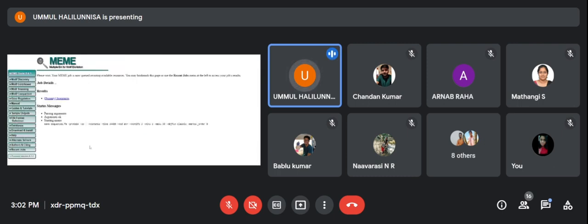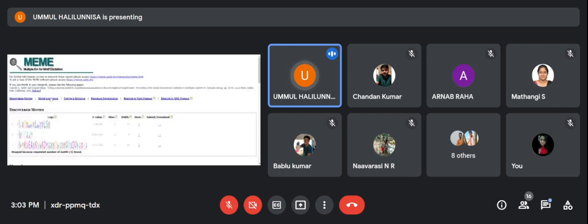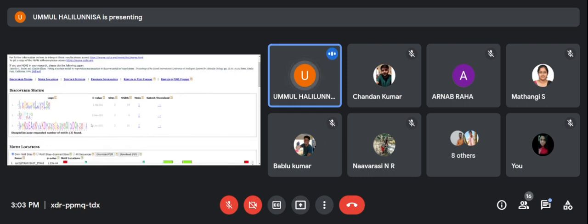We'll just check, because this protein does not have much information. We'll see whether we get results for this protein ID or we'll go for another protein ID. I will give you, you can search patterns for those motifs for those proteins. Okay, we got the results. Okay, finally we got some results for this one.